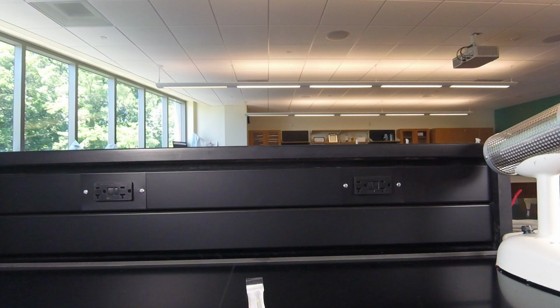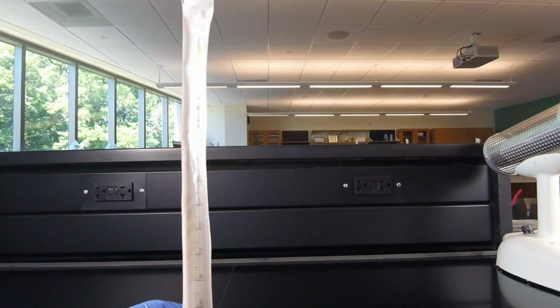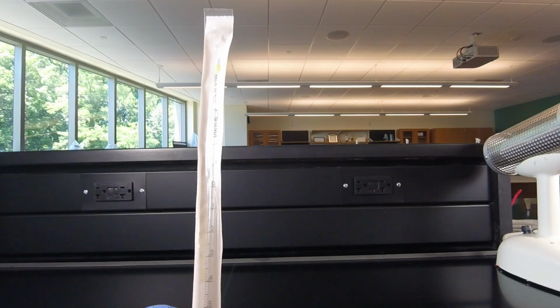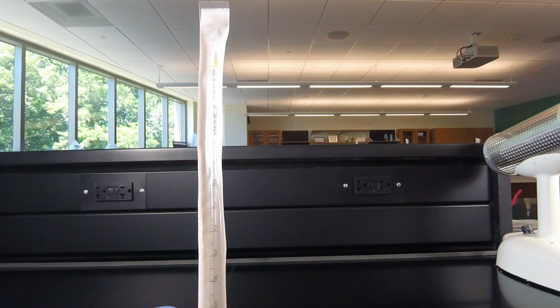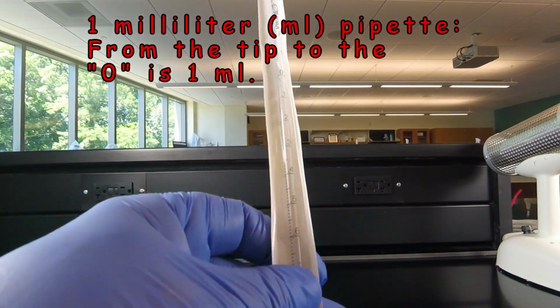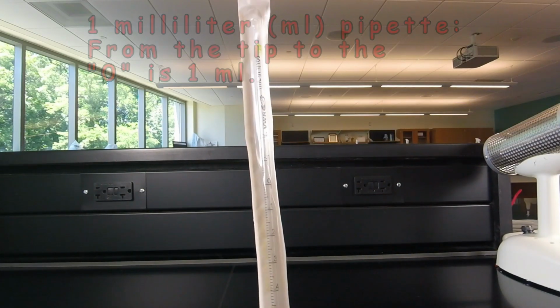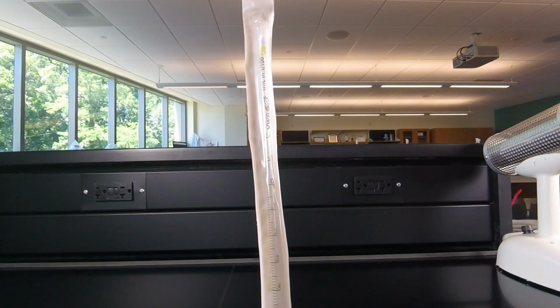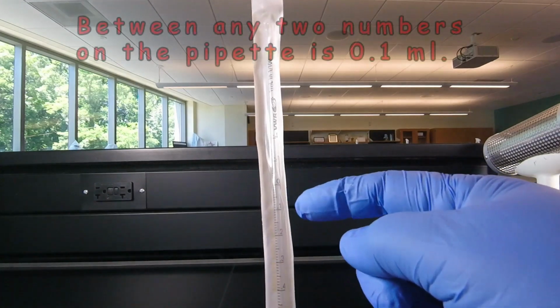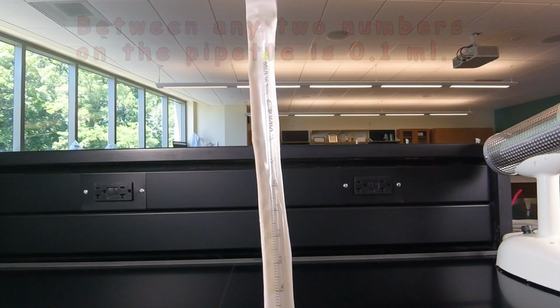Hello again. In this video lesson we're going to learn how to read and how to aseptically handle a sterile 1 milliliter pipette. These are called 1 milliliter pipettes because from the very tip of the pipette to the zero is 1 milliliter, and it's divided into tenths of a milliliter. So from 0.0 to 0.1 is 1/10, from 0.1 to 0.2 is another tenth, etc.